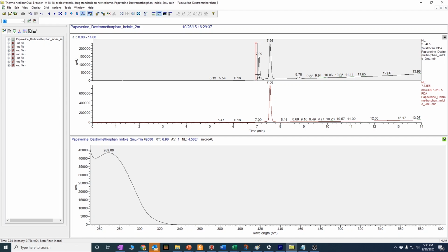almost all drugs are going to give pretty good signal on a UV. But you would not say, you know what, I'm going to look at fire debris on an HPLC with a UV detector. There's a lot of different issues there, but a big one is that a lot of the stuff you're going to look at for fire debris, alkanes, alkenes, cycloalkanes, essentially all these aliphatic hydrocarbons, are not going to absorb in the UV, and they're going to be invisible to the detector. So it's great for most organic molecules, because most organic molecules do in fact have some conjugation, but to be seen at all by a UV-Vis detector, you have to have some kind of conjugation.